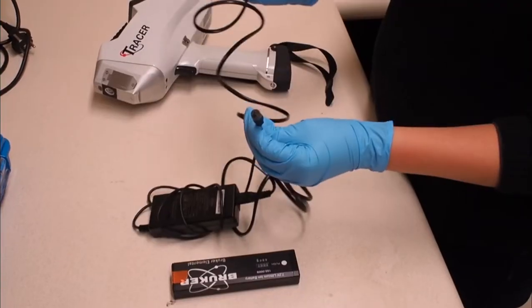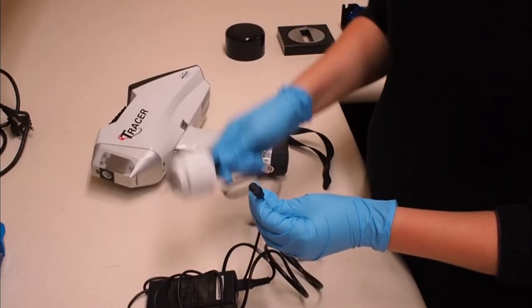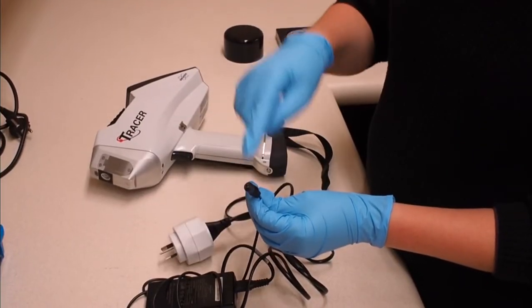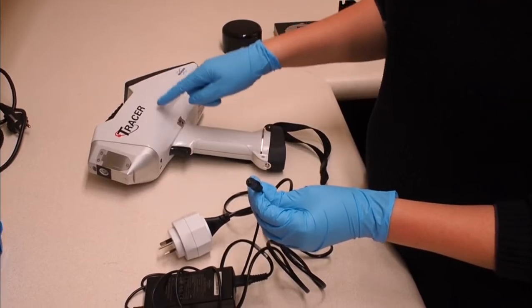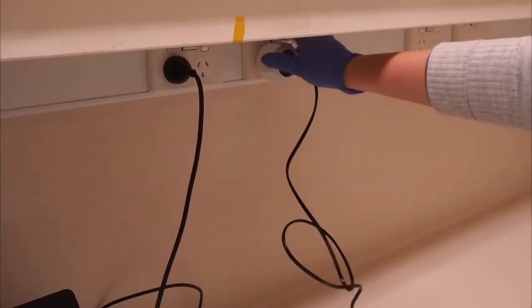If you are operating the instrument off main power, connect the power cable into the port at the back and switch on at the power point.